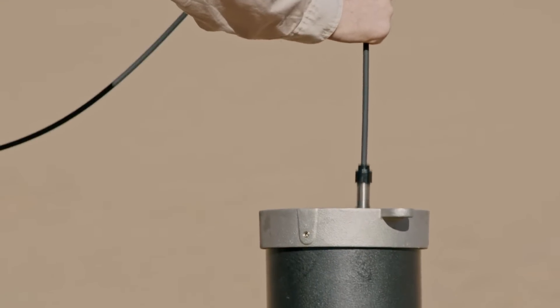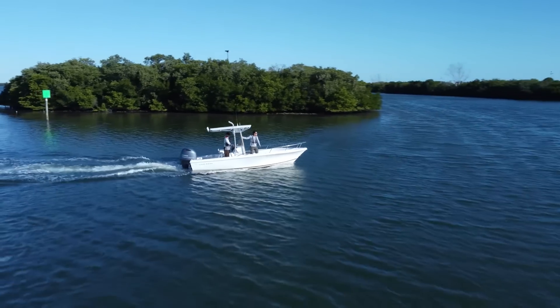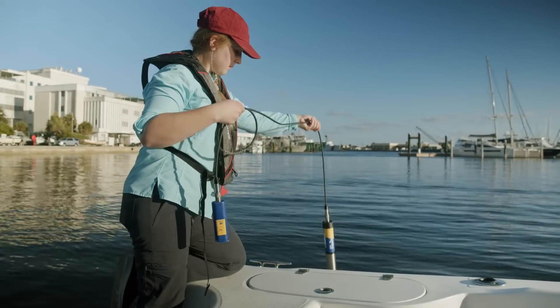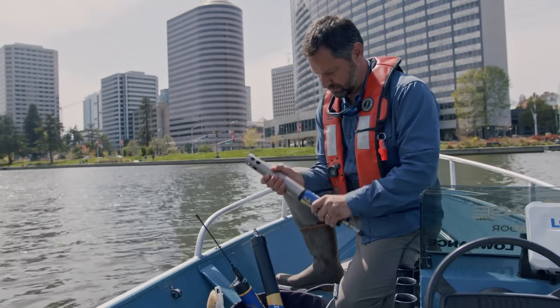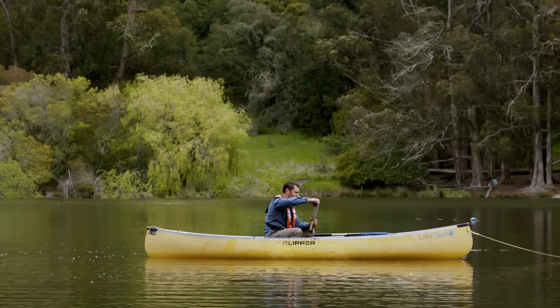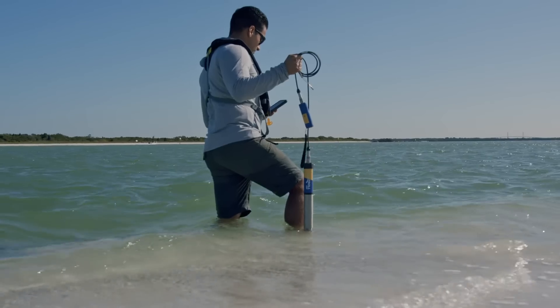We've found that the partnership using in situ equipment has allowed us to really expand our services. The price point and the ease of use allow us to use this equipment remotely across the country and train people to use it really easily. The wipers and the thought that went into the restrictor design are all things that make it easier to use the equipment in the field, be more efficient with how I calibrate and clean the equipment, and it really has expedited the work in the field.